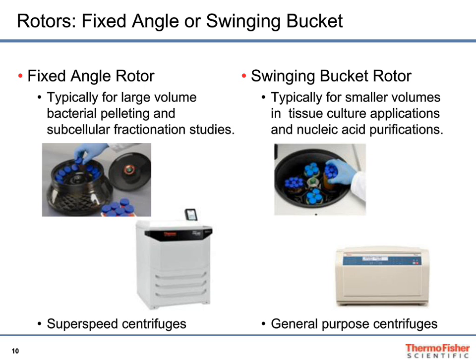But when you get down into the general purpose centrifuges you see on the right, it's much more common to have a large, very large nowadays, swinging bucket rotor with a lot of adapters. It gives you an incredible amount of capability in a fairly small package and inexpensive to the extent that you can put one of these in a lab and do many of the things that are needed and maybe not have to have this and that other centrifuge.